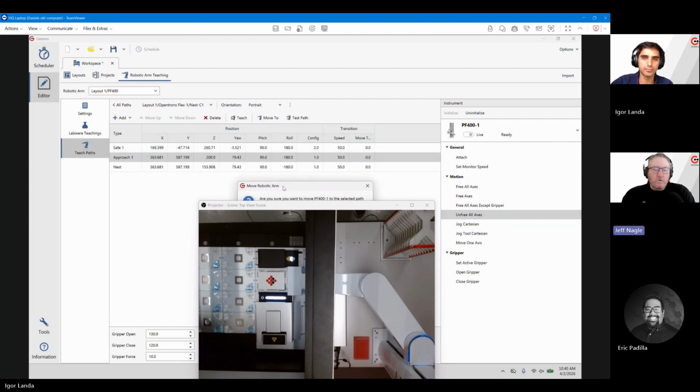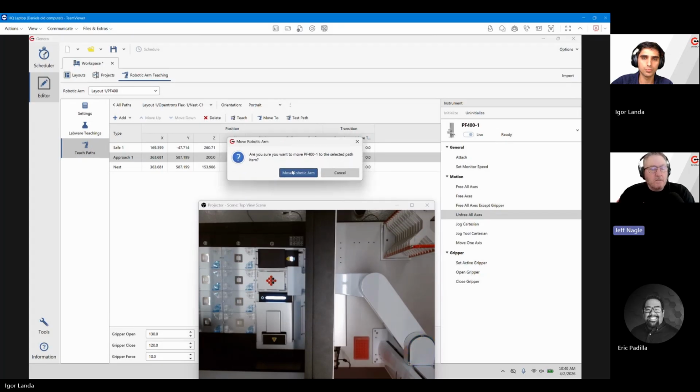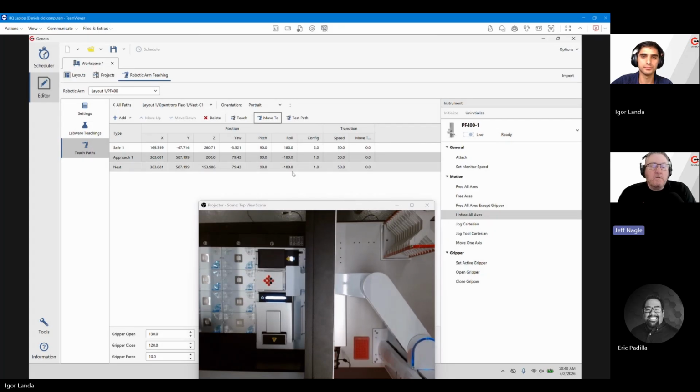Yeah, I think it's important for viewers to understand how quickly they can capture a teach point and paste it like you just demonstrated, Igor, because you're right. You're only changing the Z value. So you just want the robot to move straight up. There is no move type change here. It's just changing Z values and everything being the same. Think of it as above the nest, and then I'm just going down, up and down. That's it. So that's important that as the viewers watch this, that you can copy other teach points if need be. And it minimizes the amount of work you have to do.